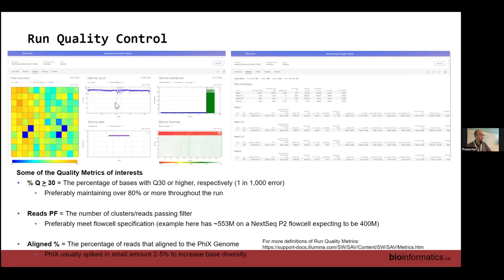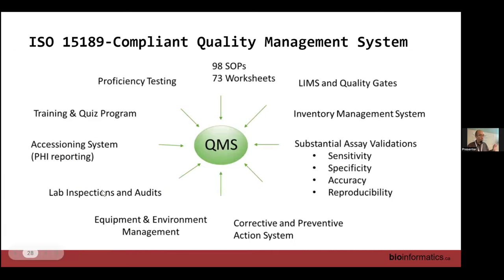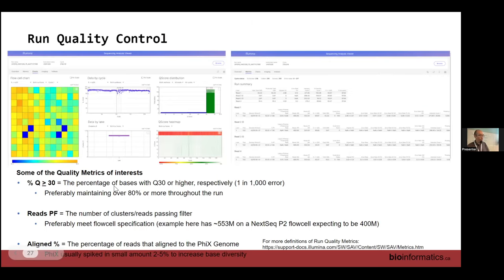And then on top of that is a pretty interesting graph, what we call the Q30 graph. Let me introduce what Q30 is. More formally, it's called percent Q30, Q over 30, which means the percentage of bases with a Q30 quality or higher. What does that mean? Q30 means a 1 in 1,000 error. If you derive it, Q20 is a 1 in 100 error, and Q40 is a 1 in 10,000 error. The industry standard right now is still looking at the error rate of 1 in 1,000, so we look at the percent of base calls above Q30.